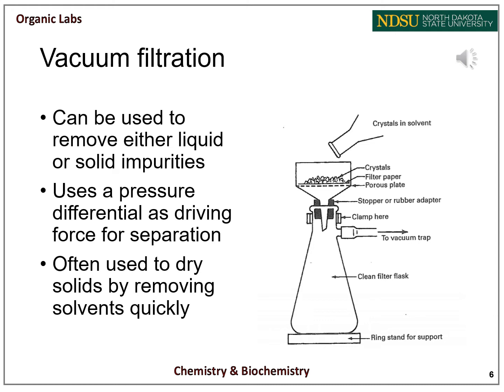Vacuum filtration is usually done as the last step of recrystallization before taking melting points as a way to dry the crystals. You wouldn't want to use a vacuum filtration as a hot filtration step because when you apply a vacuum to the solvent, the boiling point of the solvent will decrease. So if you were to do a hot filtration via vacuum filtration, your solvent would likely boil away to the extent you would get premature crystallization and you'd have to start all over.